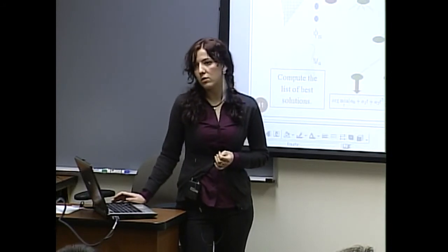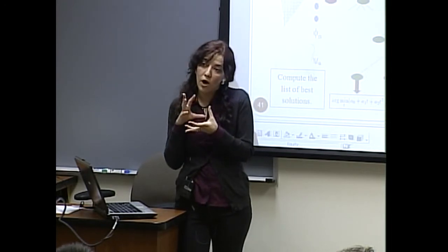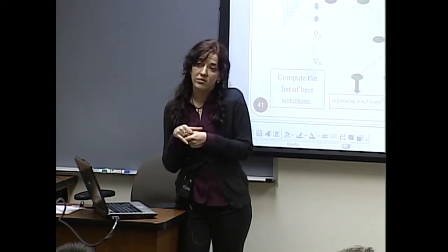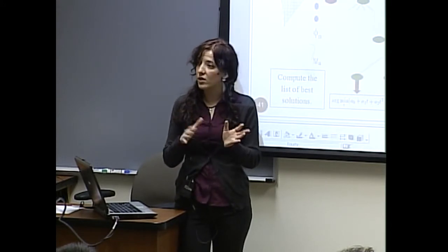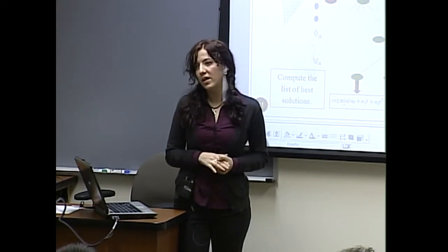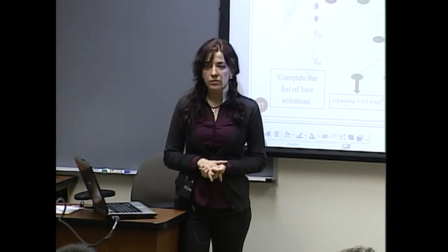Do you have to? There was some, I think it might have been in the other path where you showed, molecular dynamic simulation was needed initially. Do you rely on that? Or we don't use it at all. Yeah, that's for NOEs, because you had to start somewhere. NOEs are not even assigned there, so molecular dynamics is used to see how it will probably fold, but then it's all verified against data, and that's where manual intervention is needed, because biochemists can look at it and say, oh, this is wrong folding, let's run MD again. So those are not really automated methods, and here it's highly automated. You just run it and you get the solution.